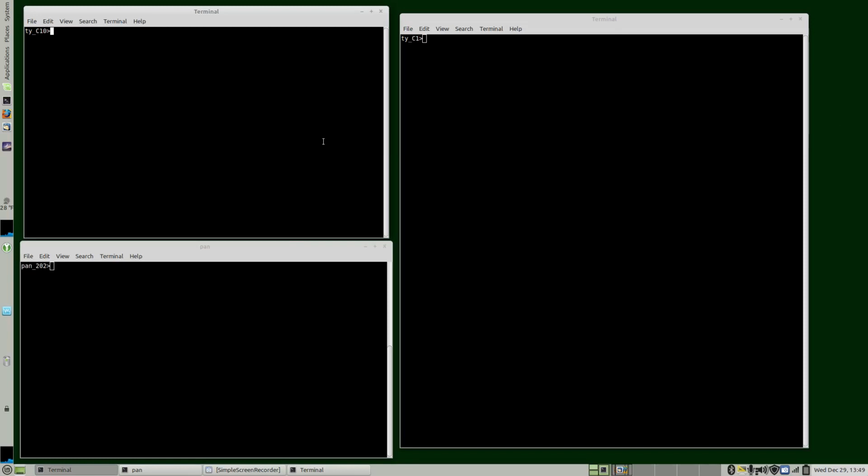Okay, this session is about an introduction to the SpecPR system. SpecPR is a program for analyzing spectra one at a time through a command line interface. It has a long history. Not going to make excuses for it. I've been hoping that better things would come along.